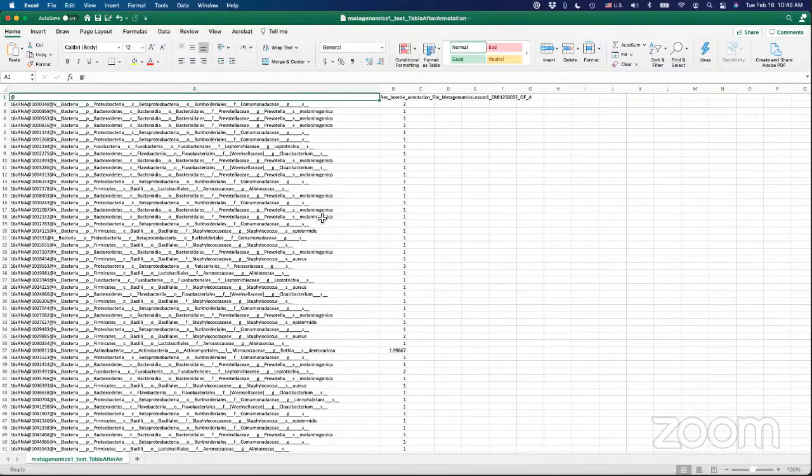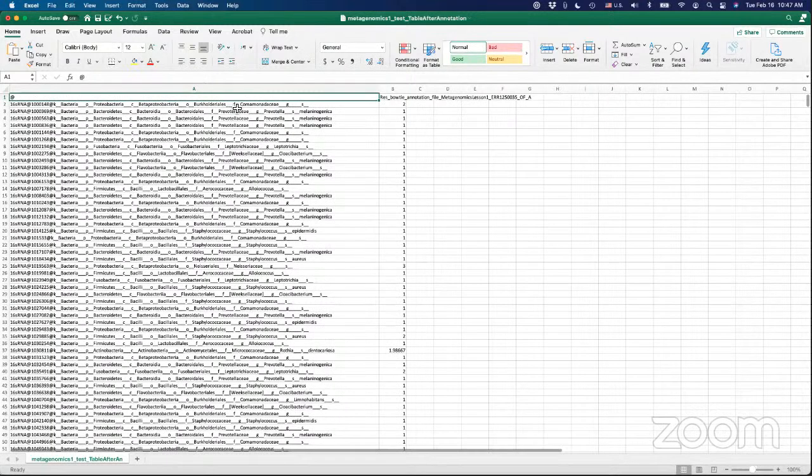Okay, what you will see is that after we have the ID, here we have the ID of this particular 16S ribosomal RNA entry, and then how it is organized by taxonomic classification. Here you can see K, P, C, O, F, G, S. These are taxonomic levels.